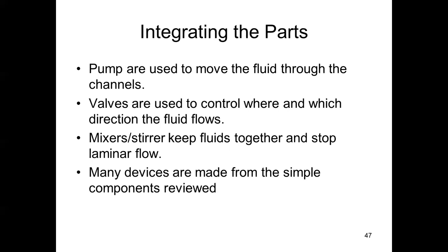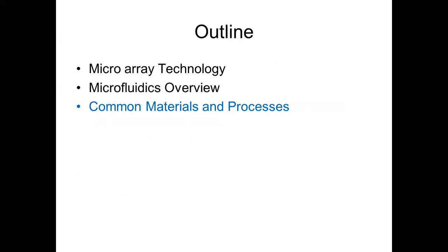And so when we integrate the parts together, we might use pumps, valves, and mixers, and then we integrate these devices, these concepts together, and we build up simple devices from these components that we reviewed. So at this point, I'd like to take a break. In the next presentation, we're going to review the materials and the processes that are common in microfluidic devices. So the first part, again, what we did is we reviewed the basic physics of microfluidic devices in a very short amount of time.